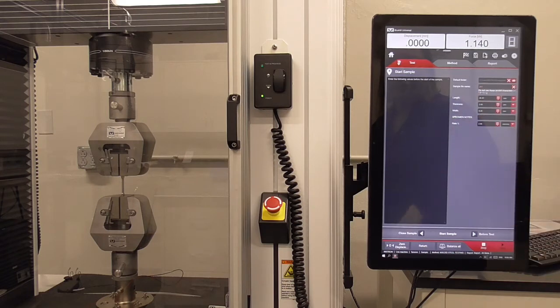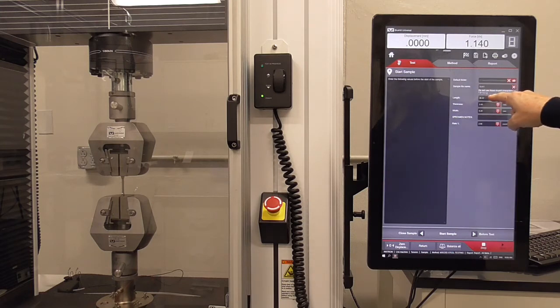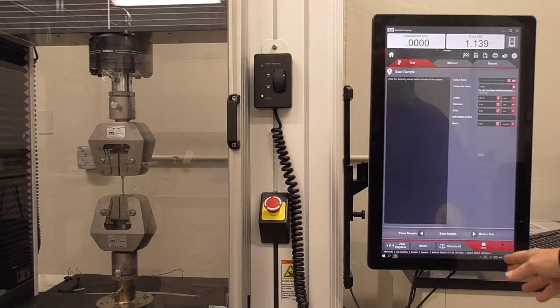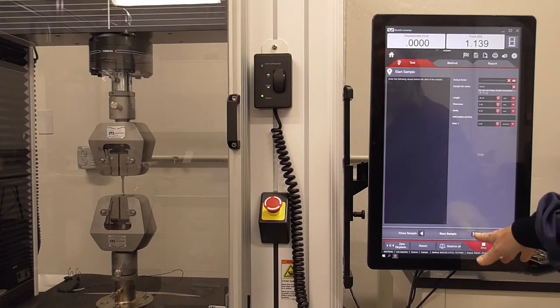Data is saved in the MSE 202 folder on the desktop, and you're going to give your file a name. Then it wants the length, thickness, and width of the dog bone — so hopefully you've measured those before putting them in the machine. Add any notes you want, and the rate at which you run the test is set at 2 mm per minute, which is an important variable to record in your notebook.